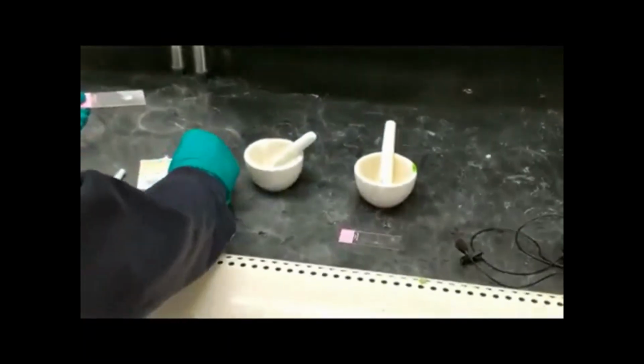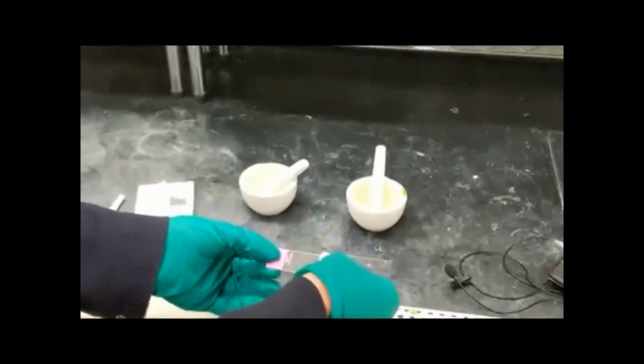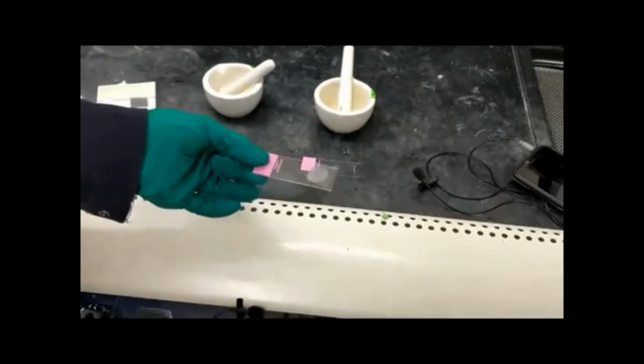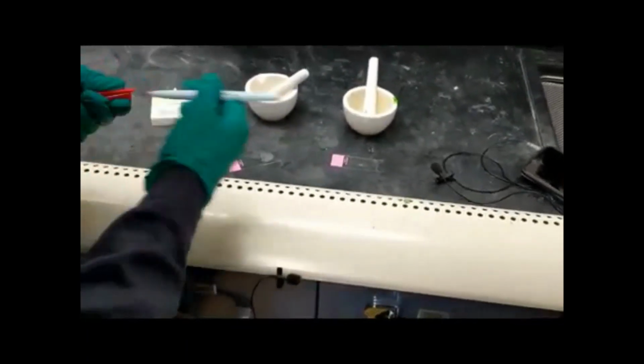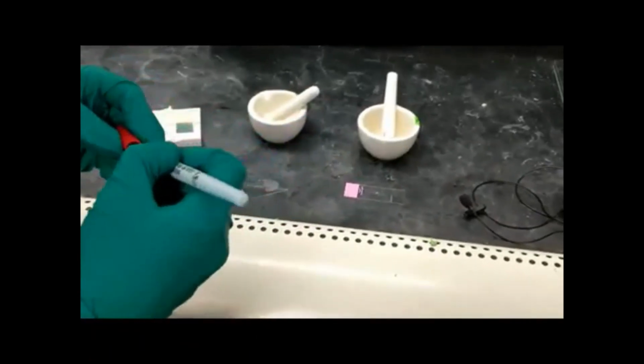We can then take one of these cover slips and carefully place it over the slide so that you get no air bubbles, or as few air bubbles as possible, and then we've prepared our sample. We will then label this as sample A and move on to sample B, where we'll do the exact same thing.